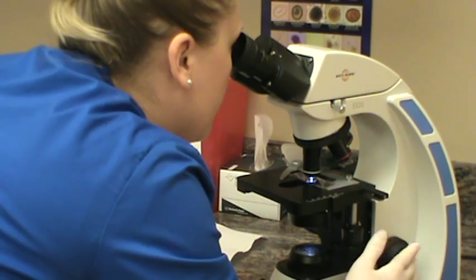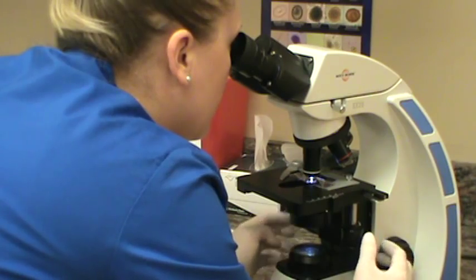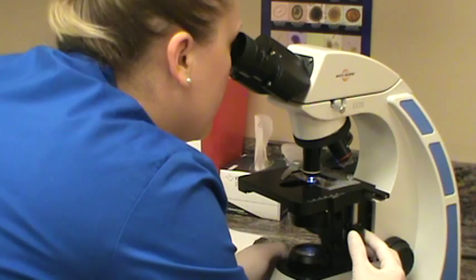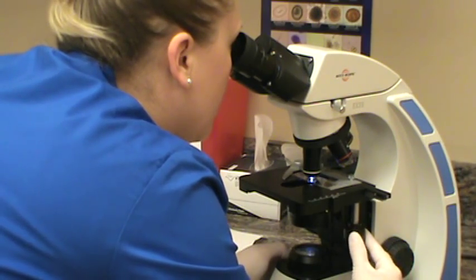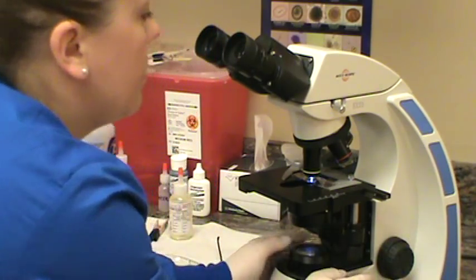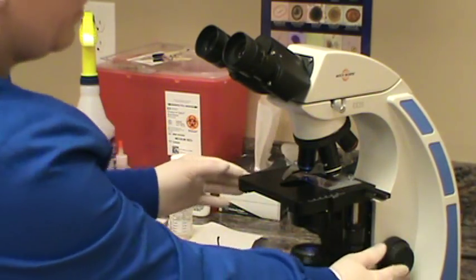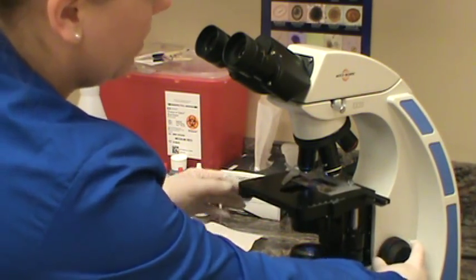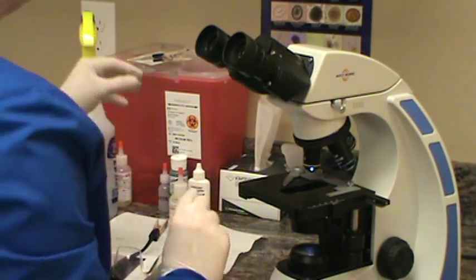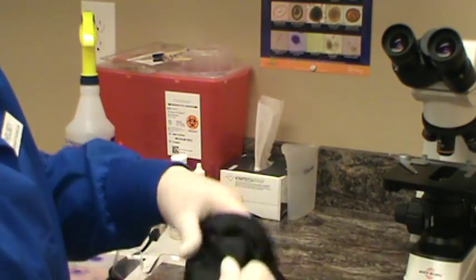Doing the focus and adjusting the light. At 100X we're seeing really large parabasal cells. I'm going to go ahead and clean that microscope off, take the stage down so we don't run the 40X over that oil — that's really bad for the 40X. Take your slide away, turn off the microscope, and clean the area for the next person.